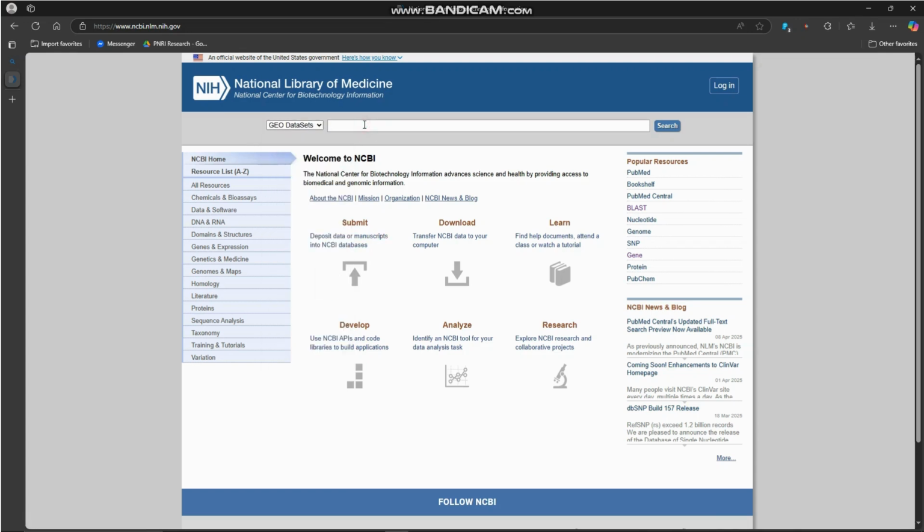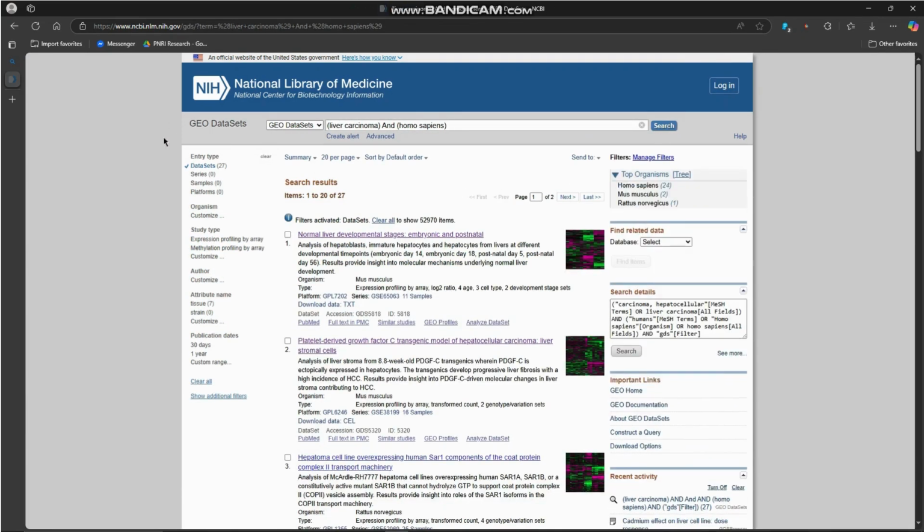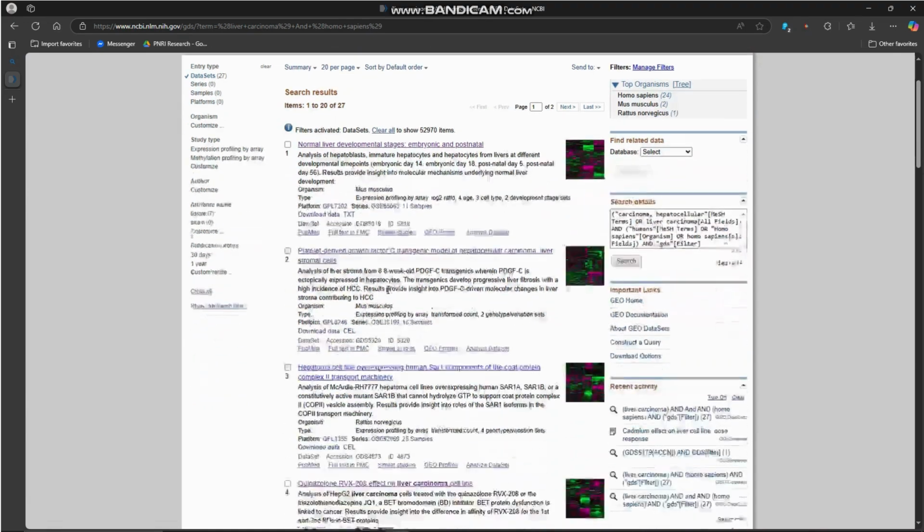Enter the condition and organism that you're interested in. In this tutorial, I'll use liver carcinoma and Homo sapiens. Now click search and wait for it to load. Make sure that the entry type is set to datasets, and now browse for your desired dataset.